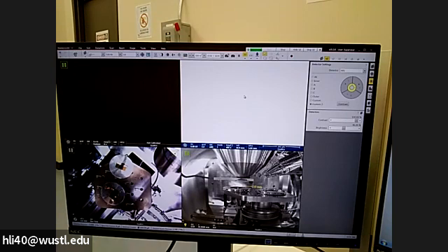We normally leave the second screen as CBS, so we can click CBS there. You can choose all, which means we will get all. If you look at it, the CBS is kind of circles. The detector is divided into regions A, B, C, D. Your signal count depends on which region you choose. It's a combination of all the selected ones, and they go to your detector and into the image.